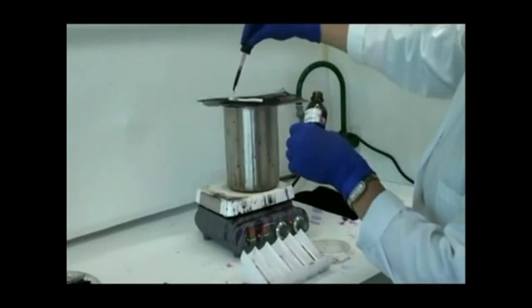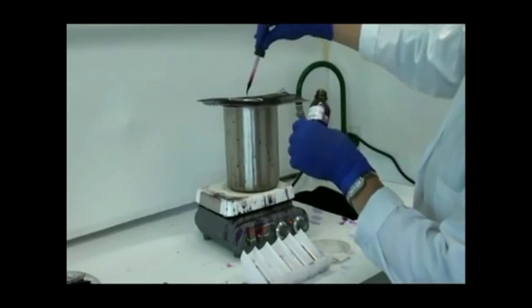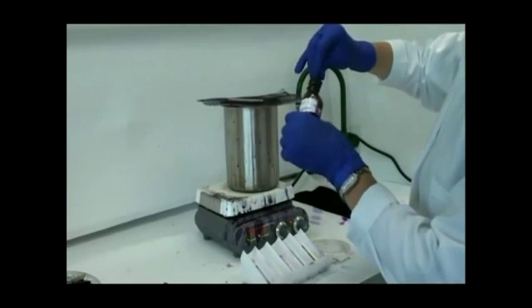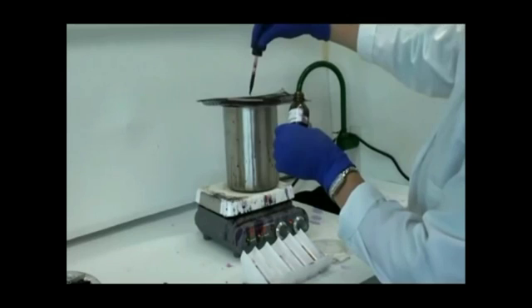I drip the primary stain onto that slide. I want to totally saturate the blotting paper. It's okay if a little stain runs over and goes into the water bath, but I need that paper completely saturated.